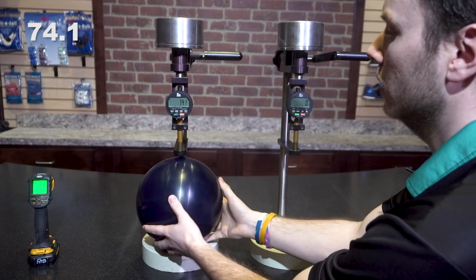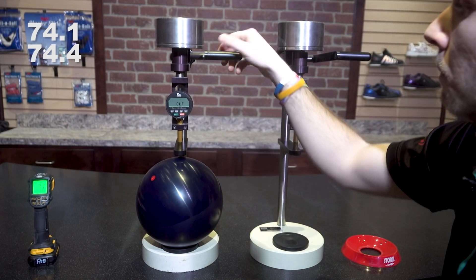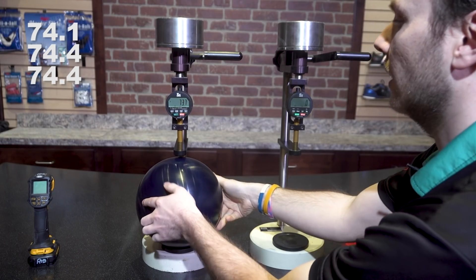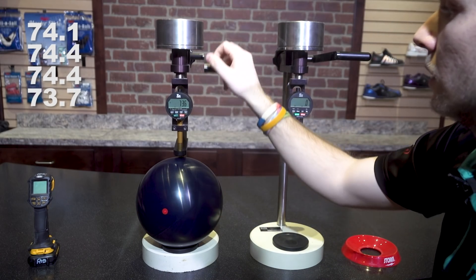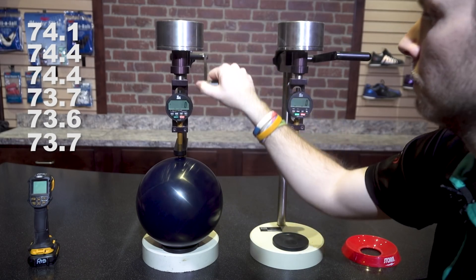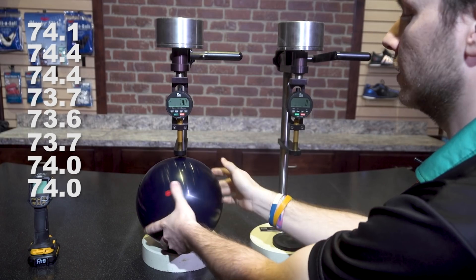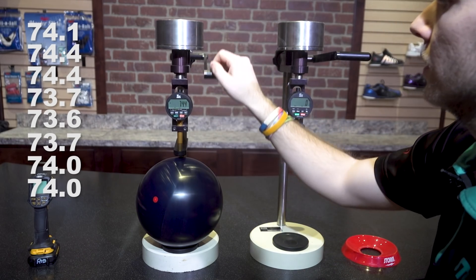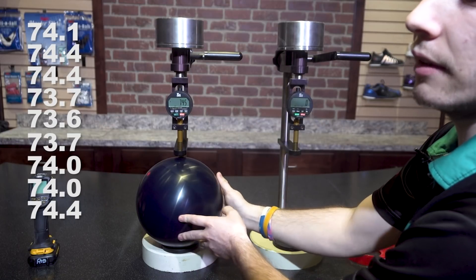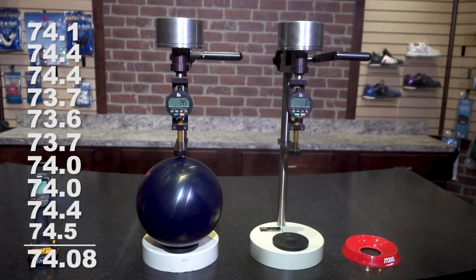Readings on the first durometer: 74.1, 74.4, 74.4, 73.7, 73.6, 73.7, 74.4, 74.7, 74.4, 74.5. That gives us an average of 74.08 on this particular calibrated durometer.